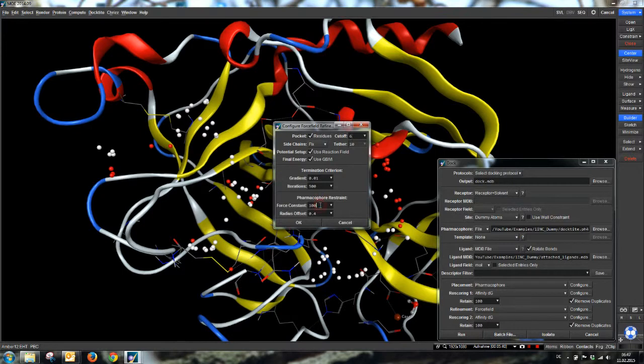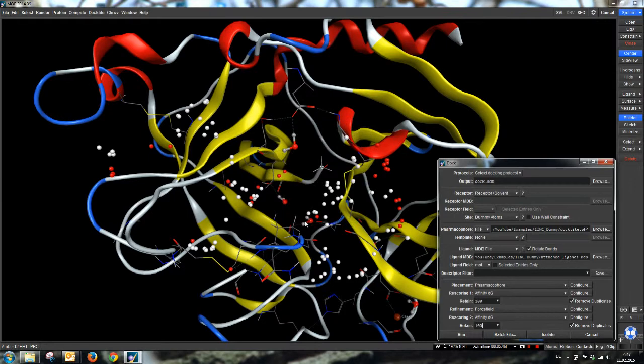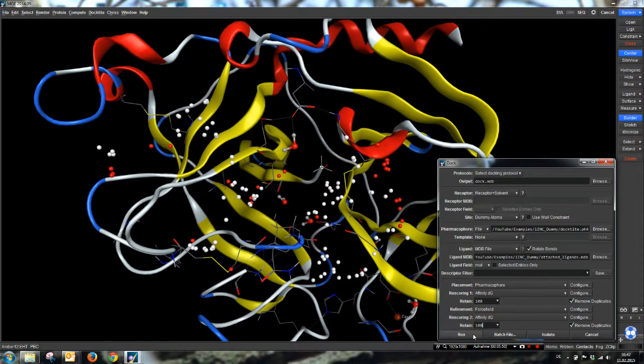And set the force constant to 1 to the power of 9, just like in the last example. We are done now. We can click on run.